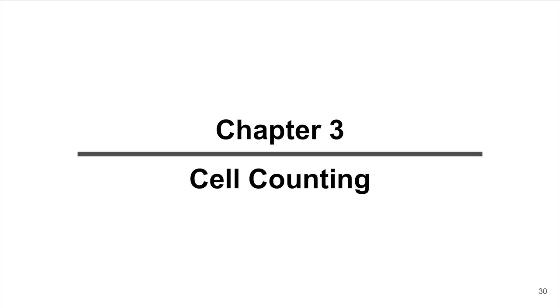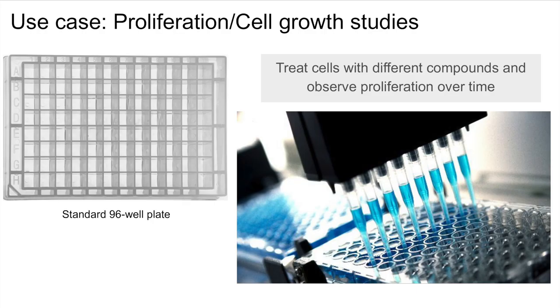In this chapter, we will discuss approaches to cell counting. The use case where this technology is widely used is cell growth, also known as cell proliferation studies.